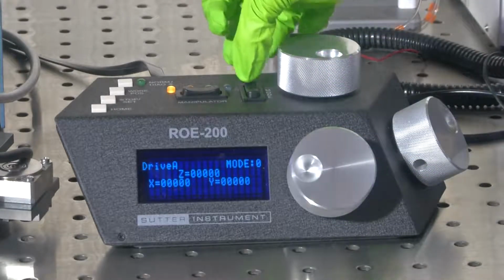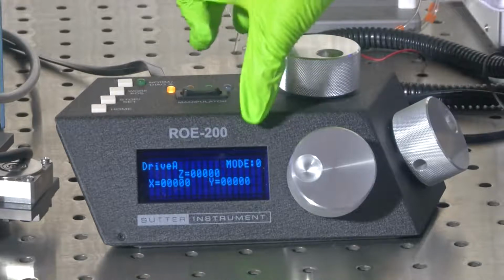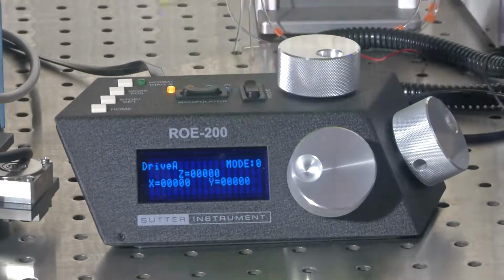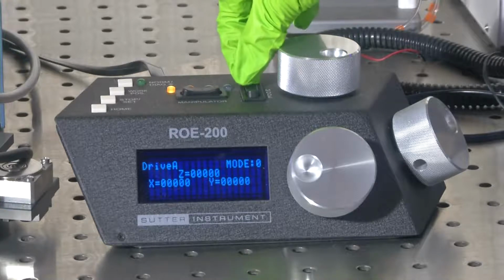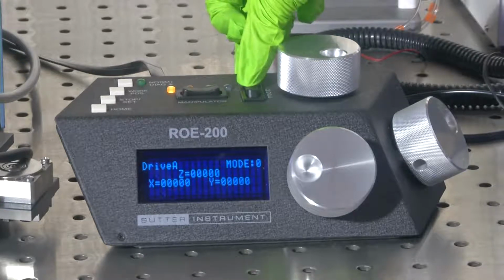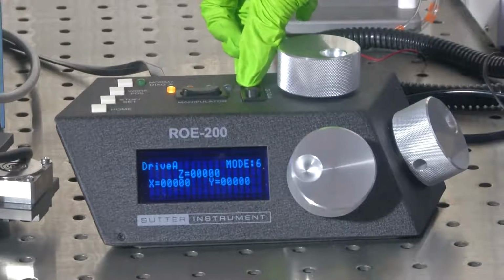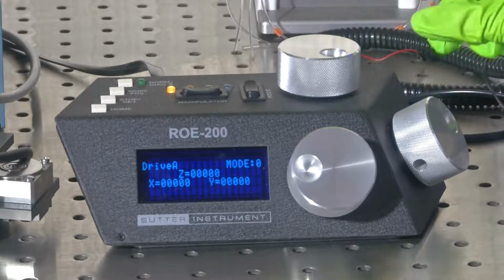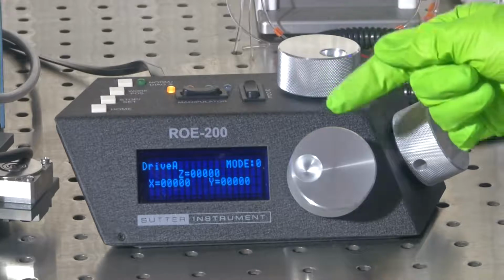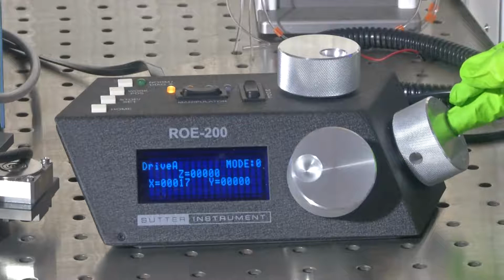Now let us see, when it is connected to manipulator A and XYZ positions are 0, how the mode function can be used to control the entire movement. So, there are 10 modes: 0, 1, 2, 3, 4, 5, 6, 7, 8, 9. As you can see, there are 10 modes. So, what does each mode do? Say you are in mode 0 and I try to change X position.